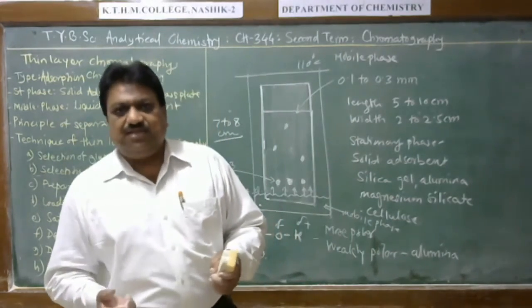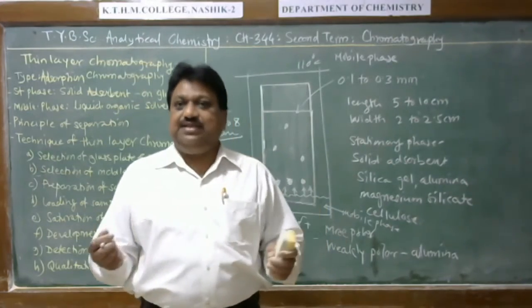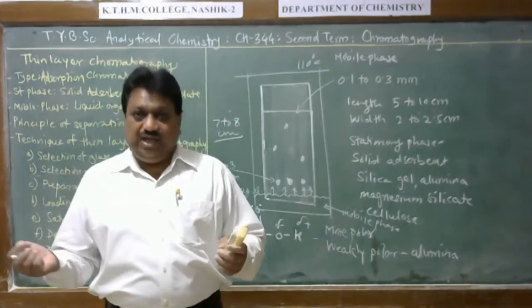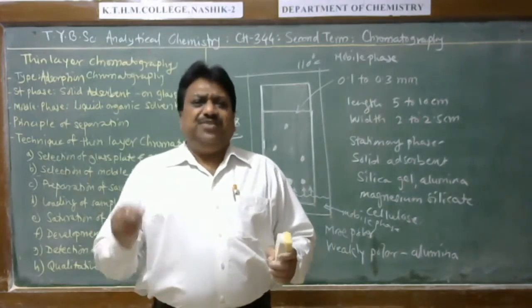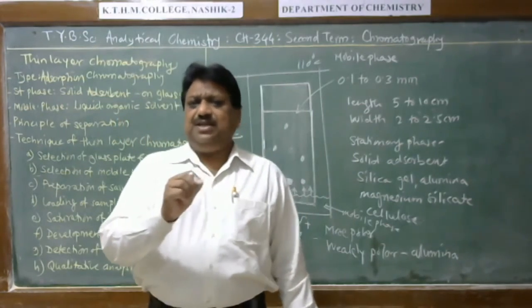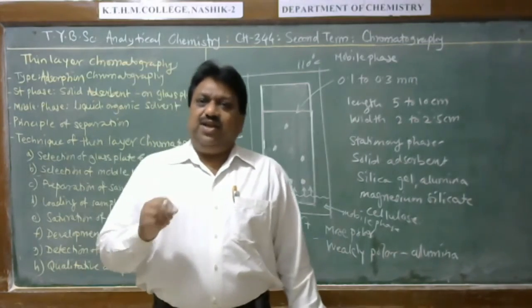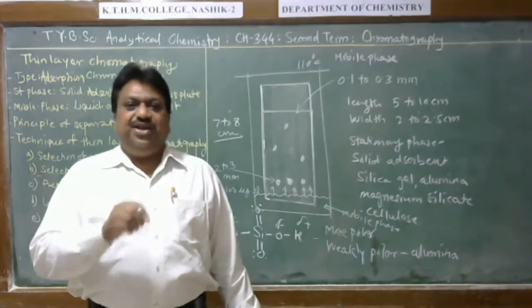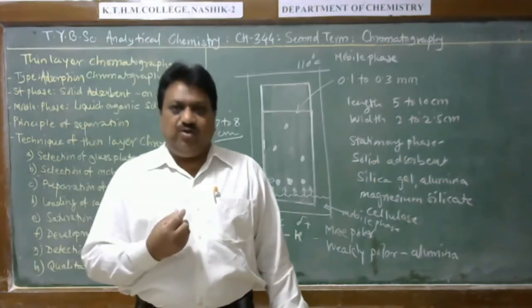In chemical methods, we can sometimes use ninhydrin for detection of amino acids, and sometimes a selective reagent for detection of particular inorganic metal ions, as in paper chromatography. Therefore, here a specific reagent or sometimes specific compounds are used for detection of a spot. Yesterday we used ninhydrin as a reagent for detection of amino acid. Here we also use ninhydrin for detection of amino acid.